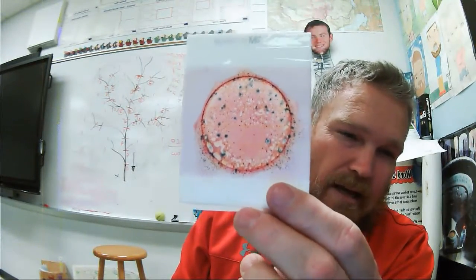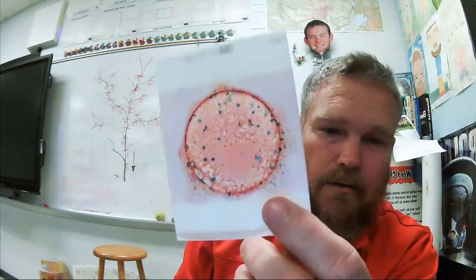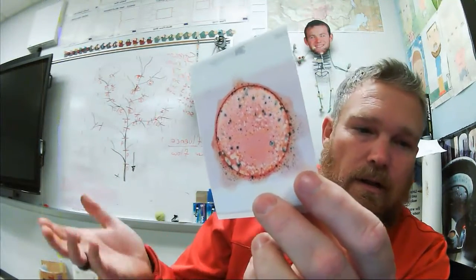This one I think we counted at 39 coliforms per milliliter, which, if we're looking at our limitations from that video before, 3,900 per 100 milliliters would be what this looks like, and 3,900 would be in the realm of fish and wildlife habitat. You wouldn't want to drink it. You wouldn't want to recreate in it. So you don't want to go swim in the area out in front of the school, because that's where this sample came from.